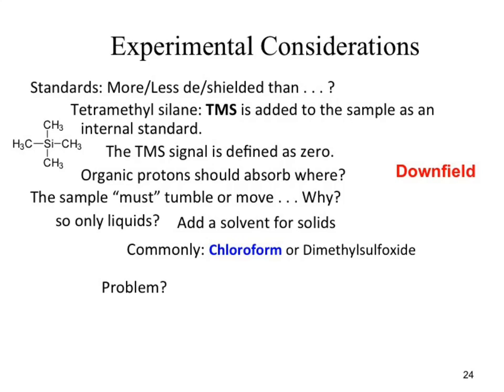So what we have to do is come up with some way to remove that signal. The way we remove that signal is by removing the hydrogen and the carbon. But how can we remove the carbon and the hydrogen? What we do is change them to a different isotope. Hydrogen is active in the NMR. Deuterium is not. Well, what's the difference between hydrogen and deuterium?